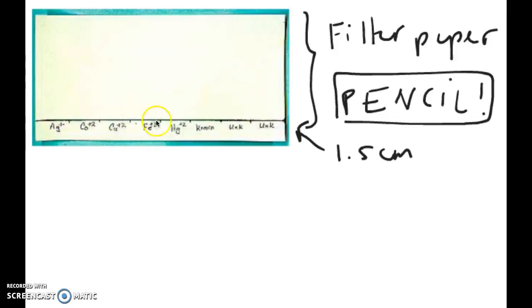One thing I want to point out here is when you're writing these things down, you're making these measurements of lines. Make sure they're all done in pencil so that they don't actually interfere with the experiment itself. The line from the bottom to the top here could be between 1 to 1.5 centimeters.